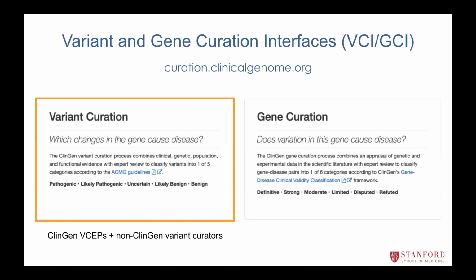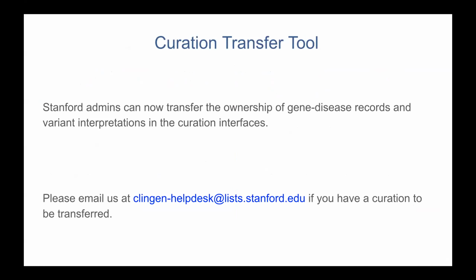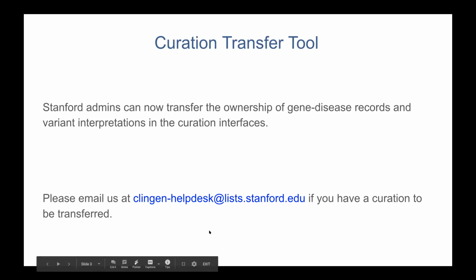So the first thing to mention is that we now have a curation transfer tool for both variant curations and gene curations. The tool is restricted to Matt and myself as Stanford admins, but if there is a gene disease record or a variant interpretation in the curation interfaces that you would like to be transferred from one owner to another, please email us at our help desk.